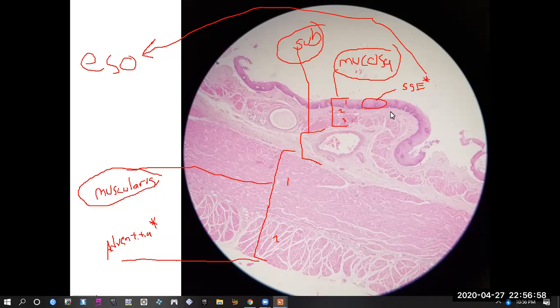It's not listed as part of the histology, but it's good to point out that there is this sublayer between here called a lamina propria. And this separates the epithelial layer, the lamina propria, second layer. And then the third layer here is the muscularis mucosae. And it's all three of these together, the epithelial layer, the lamina propria, and the muscularis mucosae, all three of those together make the larger tunica mucosa.